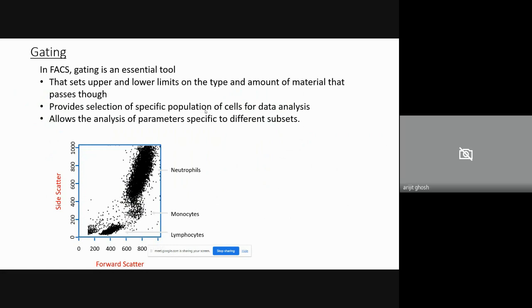And we can also check the subsets, like another marker which is expressed in 30% of the cells, and a third marker that is expressed in 20% of that 30% of the selected cells. So we can also check the subsets of populations by gating.